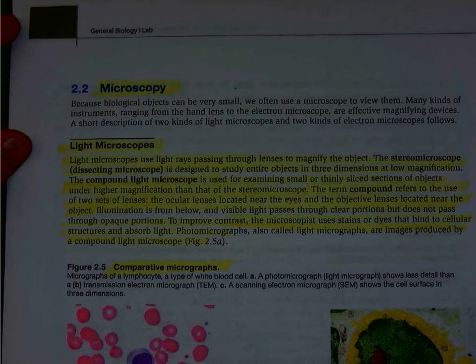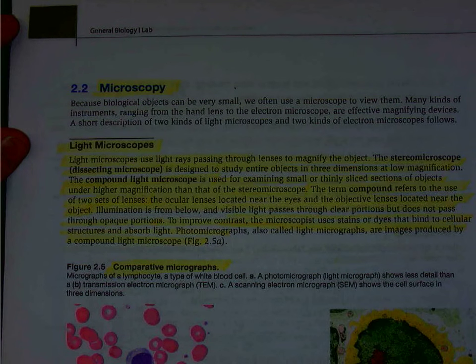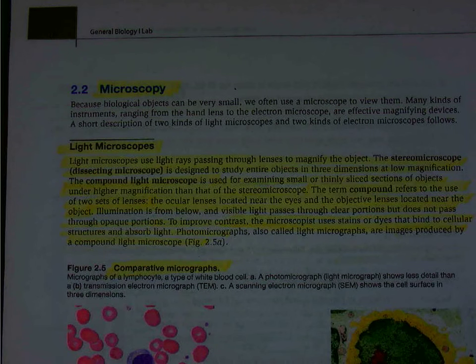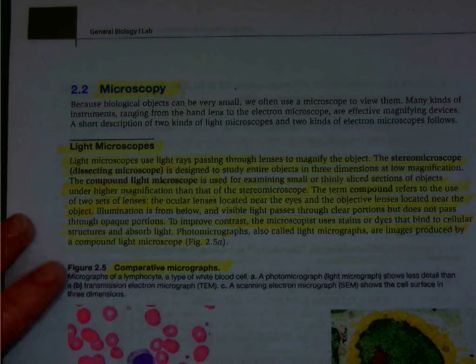Here on page 22, we see some discussion about the difference between the stereo or the dissecting microscope, which we would use to view a larger object like a whole fly, a piece of bark, lichen, various objects, versus the compound light microscope, which is going to view very small materials. It's called the compound light microscope because it has two places where it magnifies: the ocular or the eyepiece and the objective that we have clicked into place.